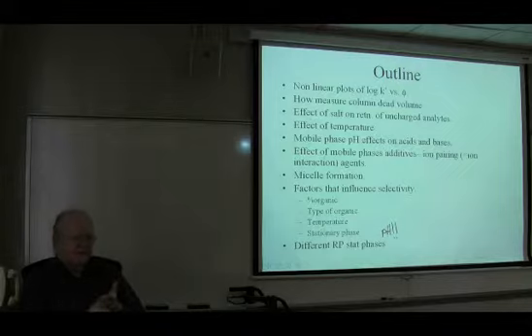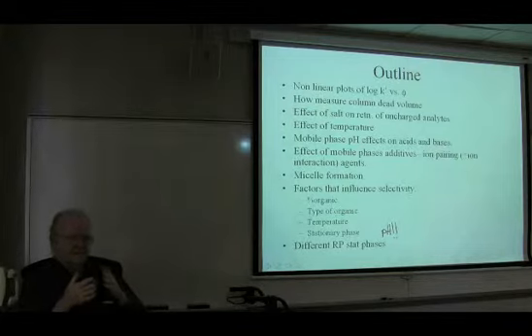They need to be fully miscible with water. You don't ever want to be pumping a two-phase system through your column. You'll never get reproducible results. It will drive your detector crazy. You don't want to do that.